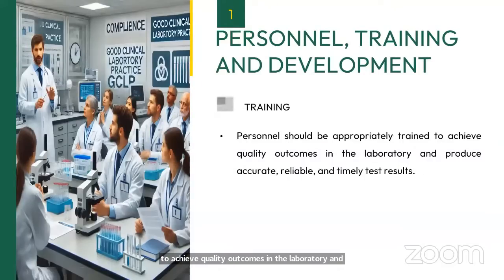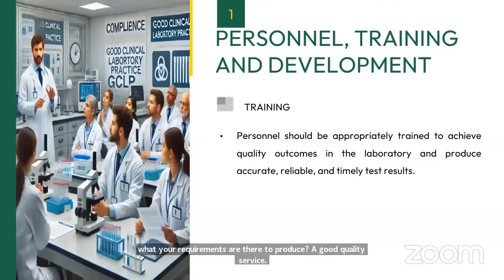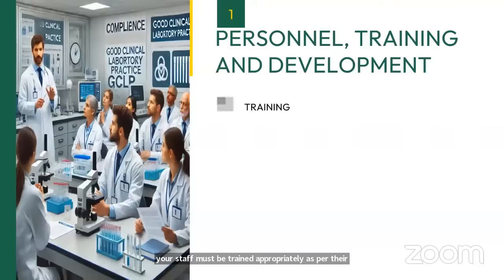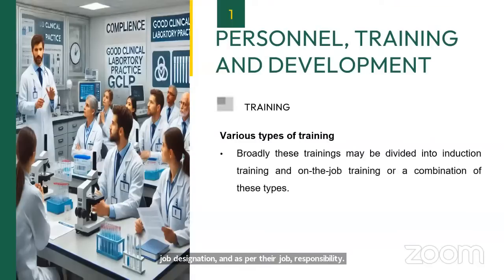So, whatever requirements are there to produce a good quality service or to deliver a good quality laboratory result, to achieve that goal and to produce accurate, reliable, and timely test results, your staff must be trained appropriately as per their job designation and as per their job responsibility. Now, there are various types of training.